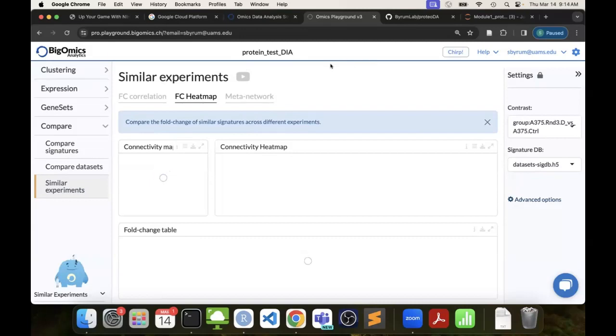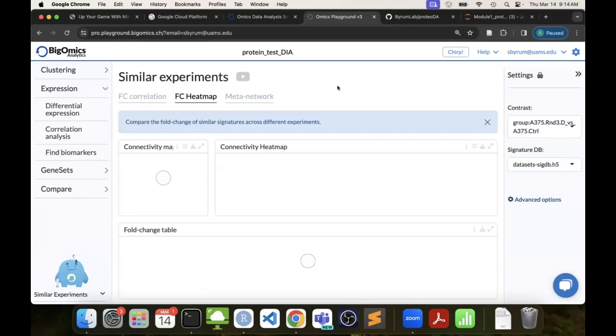So as I learn more, as I get into this deeper with these different projects, I'm going to try to break a lot of these different modules and steps again into another little video. And I'm trying to keep my videos short so they're not just hours of listening to YouTube and me talk. But it's going to be helpful because here you can actually share a project with someone else just through an email address. So if I want to share this data with somebody, I just put their email in here, now they can access it. So that's what makes it really beneficial, especially for our Embry network.